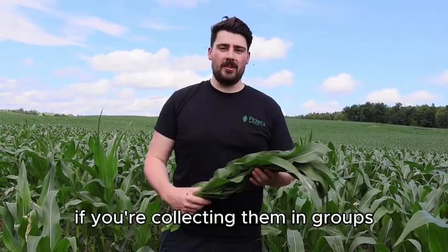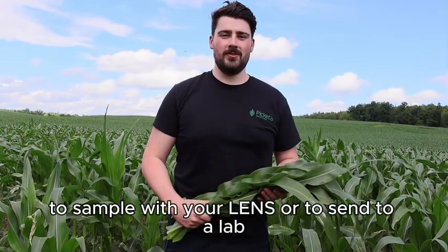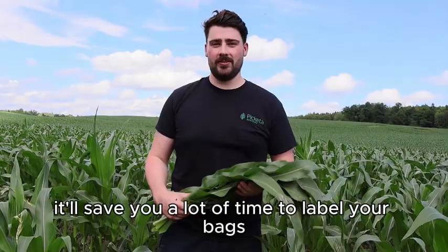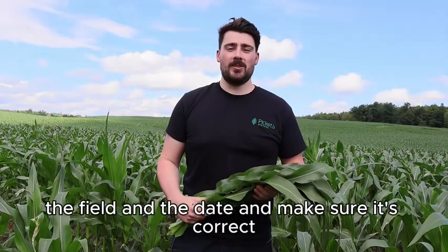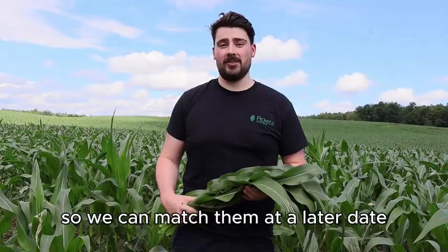If you're collecting them in groups, bring them back to the one location to sample with your lens or to send to a lab. It'll save you a lot of time to label your sample bags ahead of time. The information needed is typically the farm, the field, and the date. And make sure it's correct both on the bag and within the lens system so we can match them at a later date.